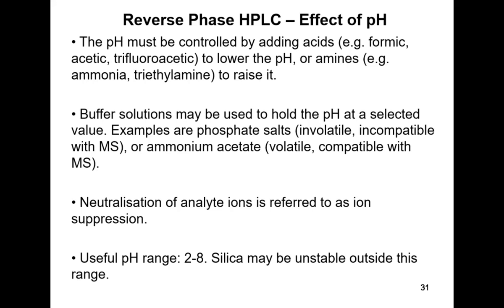If you think about the HPLC method that we're using for the practical class, that buffer solution contains phosphate salt. And phosphate salts are very good pH buffers. They allow very good control. They hold the pH quite stable.